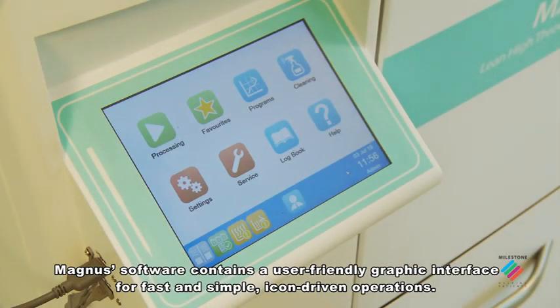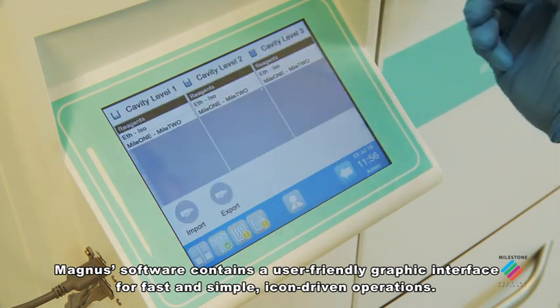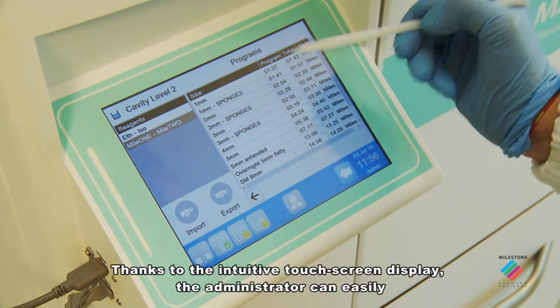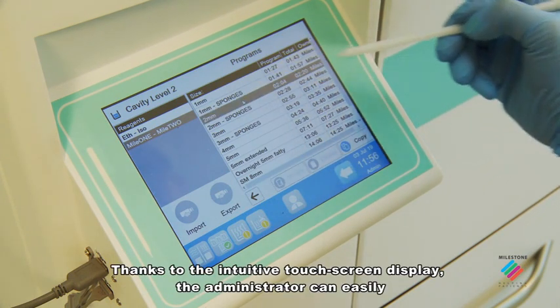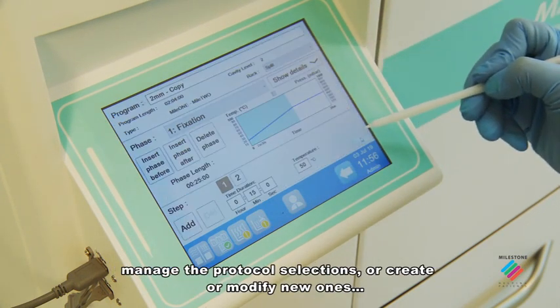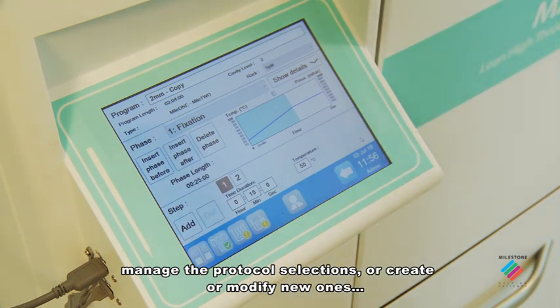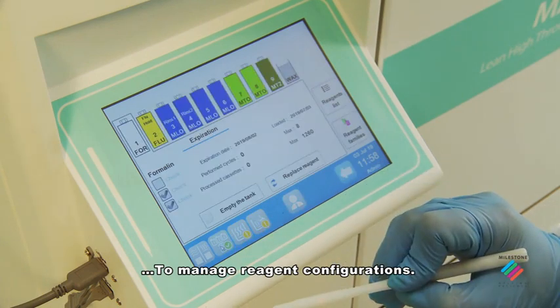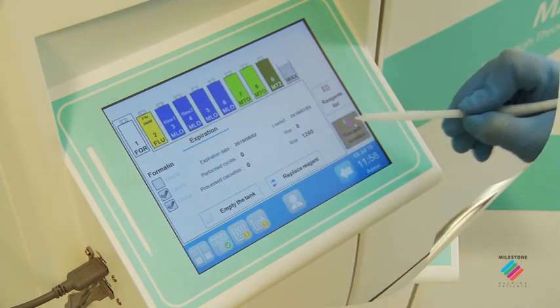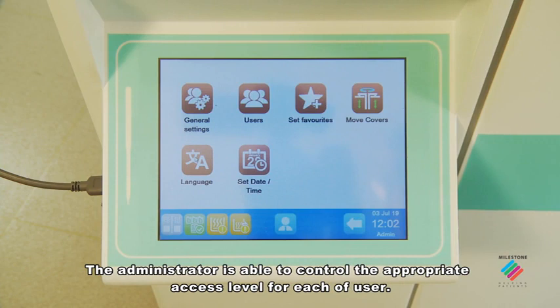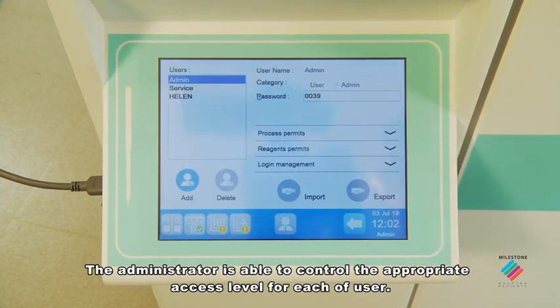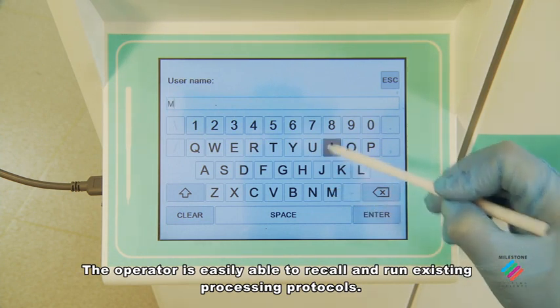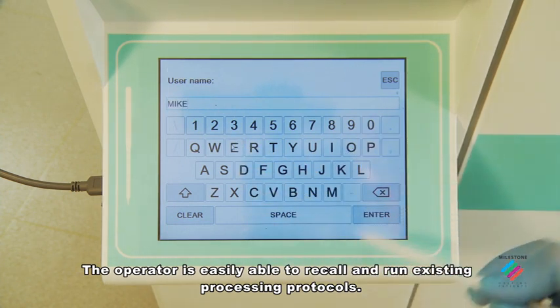Magnus software contains a user-friendly graphic interface for fast and simple icon-driven operations. Thanks to the intuitive touch screen display, the administrator can easily manage the protocol selections or create or modify new ones to manage reagent configurations. The administrator is able to control the appropriate access level for each user. The operator is easily able to recall and run existing processing protocols.